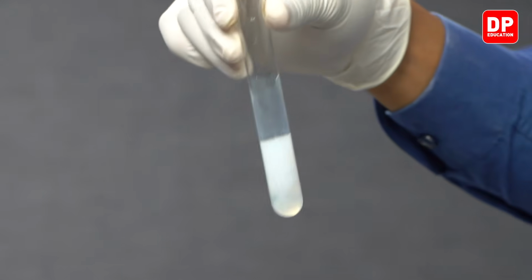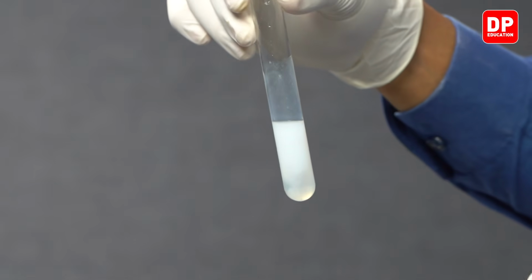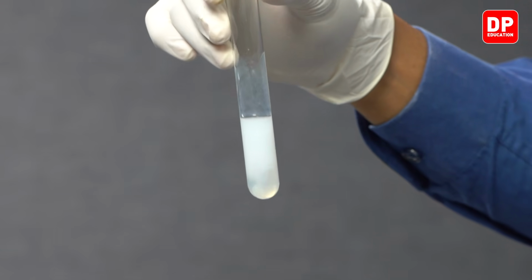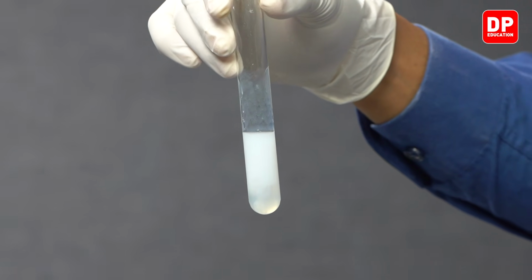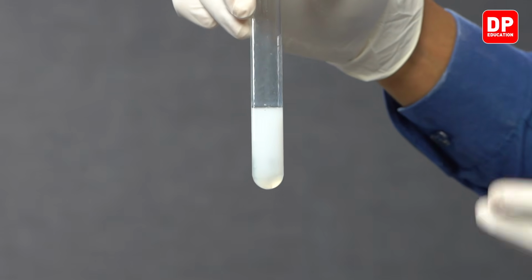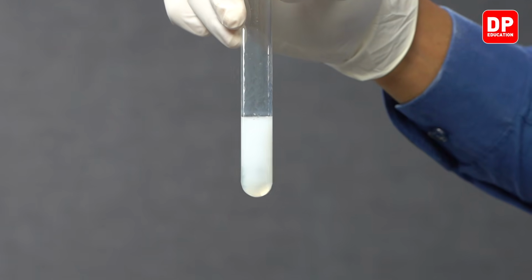Actually, the precipitate just increased because there were some magnesium 2+ ions that didn't react earlier with the hydroxide ions because we didn't introduce enough hydroxide ions into the medium. But when we added more and more concentrated sodium hydroxide, we see that magnesium hydroxide that is produced is not dissolving.